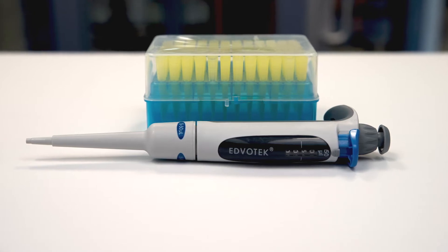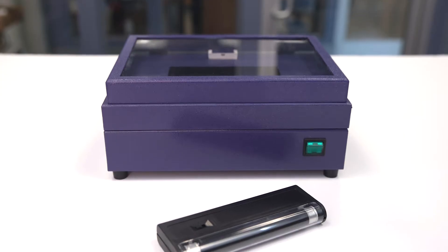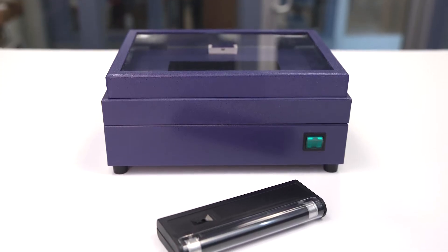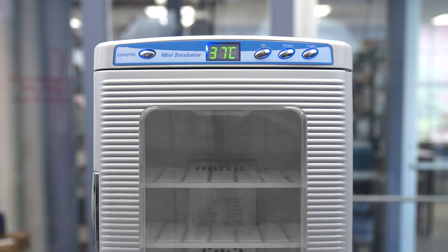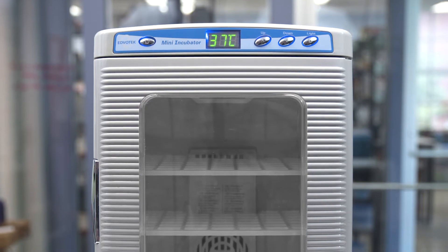a micropipette and disposable tips, a handheld long-wave UV light or UV transilluminator, and finally an incubation oven set to 37 degrees Celsius.